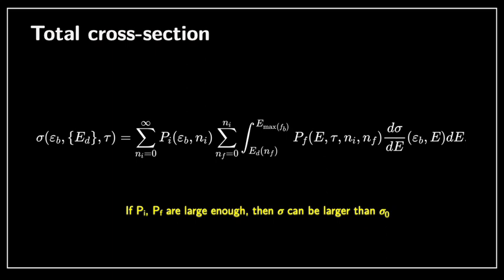So do not worry too much. Do not think so much of the equation if you're not comfortable. Think about the fact that you have your material. The material is going to get a number of electronic excitations due to the interaction with the electron beam. Some of those excitations are going to relax, and the relaxation can be pretty fast. And at the end of the day, what we're interested in is how the surviving excitations modify the threshold energy. That's basically what this equation does, and we are going to look at that.